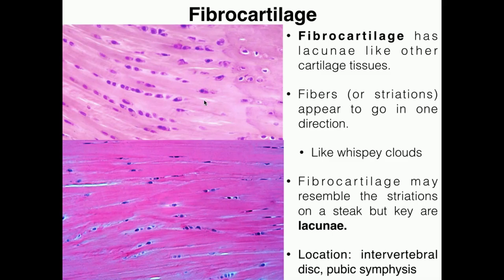In fibrocartilage, we have what are called striations — a general appearance of fibers all going in the same direction. Notice if you look at it, in this top image the fibers or striations appear to go from up here kind of down there. In the bottom picture, they seem to be going roughly horizontally. In fibrocartilage you do have these striations, which is very important to recognize. You have both the lacunae with the chondrocytes, but also these striations that generally go in one direction.